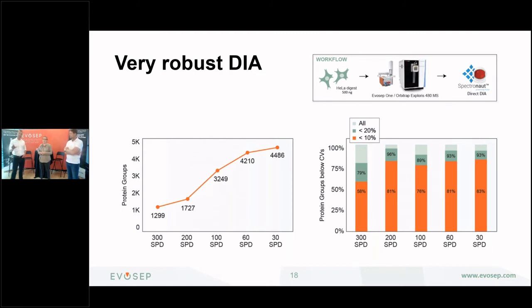So this slide really shows a data set that's available to everybody, right? Yes, because it's the Evosep, our standard columns, the Exploris 480, and then you use directDIA in Spectronaut. No spectral library is required for this, so it's completely plug and play. It's without FAIMS, so one can boost it even more, maybe. But this is key: it doesn't depend on how well you create a spectral library. This is something that everybody can do. You can decide what depth and what throughput you're looking for, put this together, and start running more or less out of the box. So great stuff.